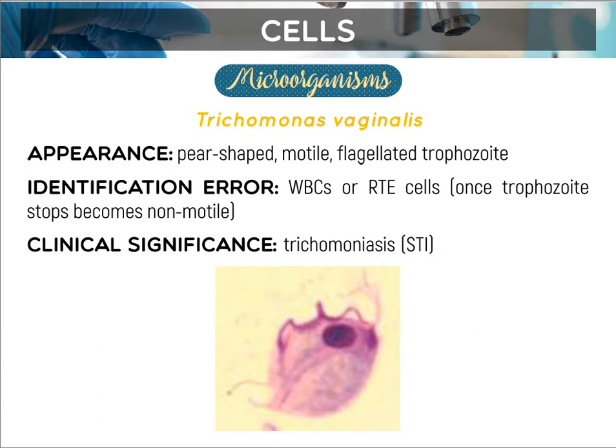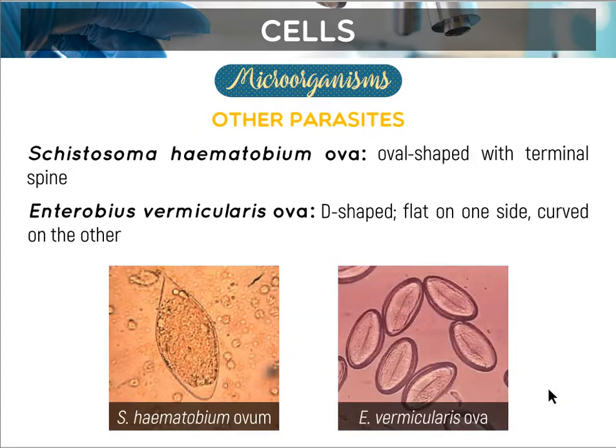So that is terrible, guys. I hope you can see the Trichomonas vaginalis in the video. Okay? So alright, so much for that.